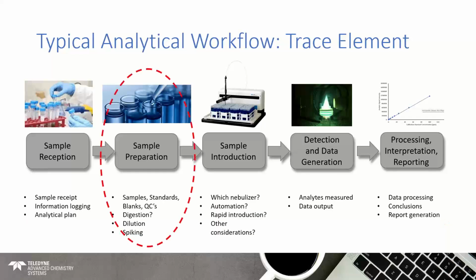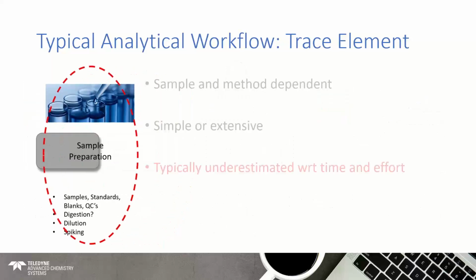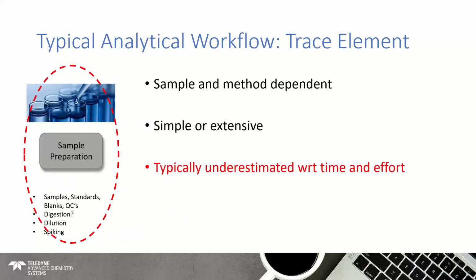So today we're going to focus on the sample preparation aspect of the workflow. As I mentioned, this is an area which can be quite simple or it can be quite extensive, but it's going to be dependent on the sample and the data that you want to get out of this. If you have samples that have a high level of total dissolved solids, for example, you might require digestion or filtering.